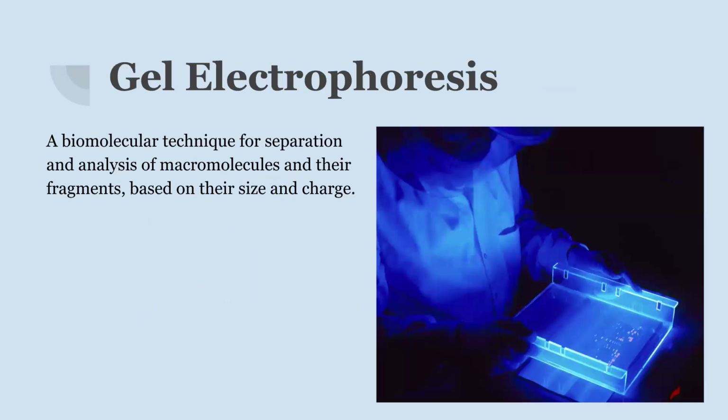So we're going to talk a little bit about gel electrophoresis. I know we hit on this last week, but this may be something that you guys aren't as familiar with because it has been a while since you've heard about it. Some of you haven't heard of it since high school. So this is a biomolecular technique for separation and analysis of macromolecules and their fragments based on their size and their charge. We did hit on that a little bit last week.